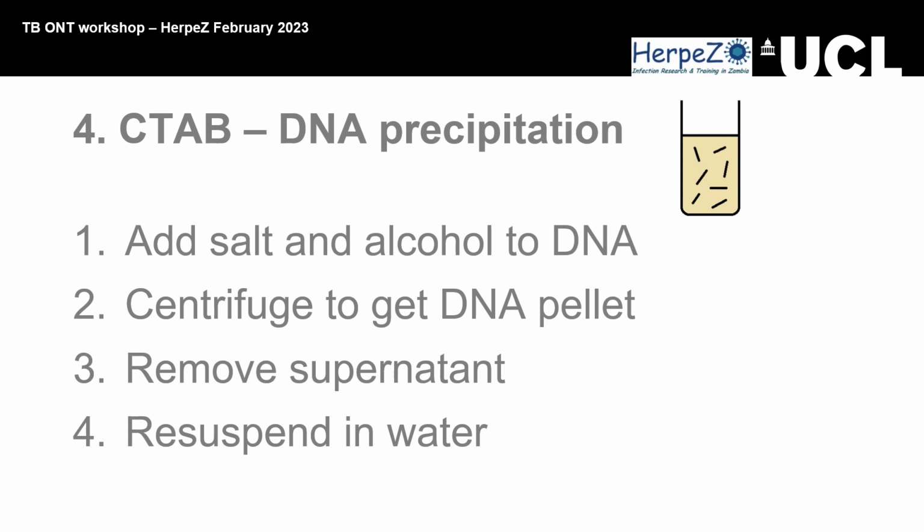So if you started with a volume of 150, you have to add isopropanol of 150. If you started with a volume of 200, because you're having different volumes of DNA from the colonies, you can't just add, like, you're adding 1 to 1. So 1 to 1 will depend on the sample volume that you have.